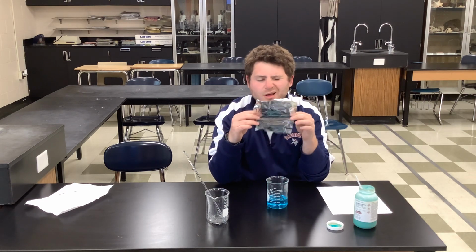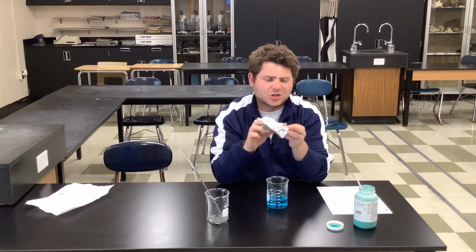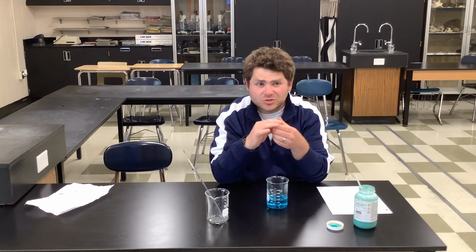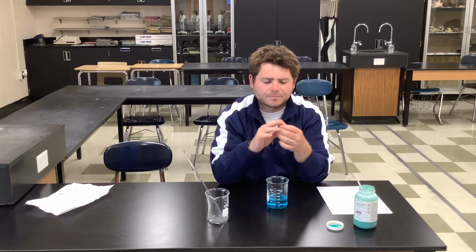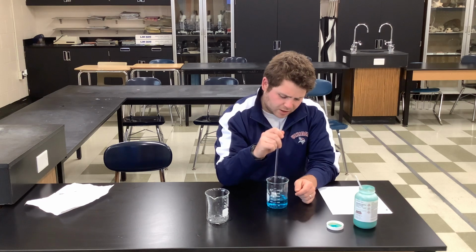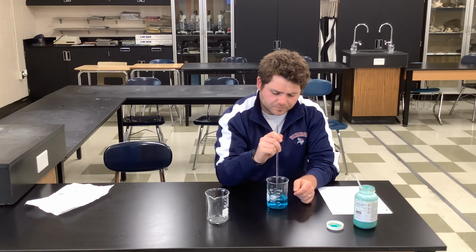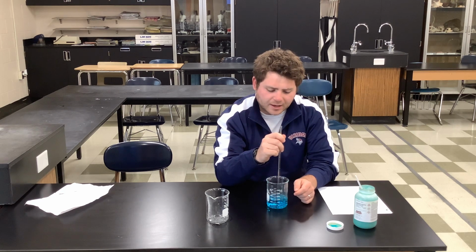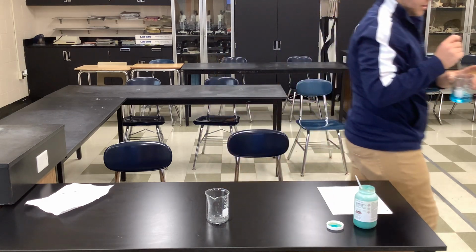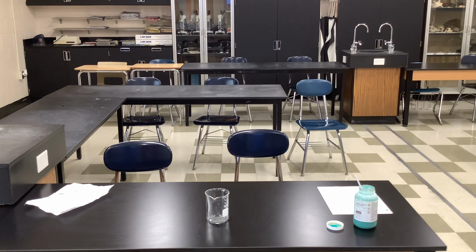Now what I want us to do, we are going to take some aluminum foil. All right, I'll give you a sheet about this size. I want you to crumple it up, okay? And you'll tell me what type of change this crumpling is to the aluminum foil, okay? And once you've crumpled it, you're going to drop it into the copper chloride. You're going to poke it down, mix it around, and see how it changes. So at first, you may not see a lot, okay? It may look like nothing's going on. However, after a while, you will see a change, okay?